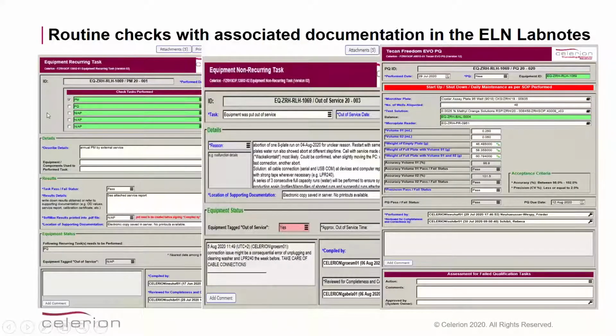I want to focus now on Lab Notes and show you with the following examples how it works. Before, a brief introduction to Lab Notes. Lab Notes is an electronic laboratory notebook that is very flexible, and most important for us, it is compliant with Title 21, Part 11 of the Code of Federal Regulations.